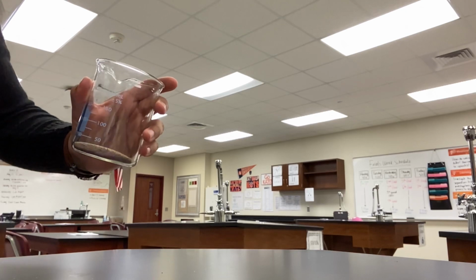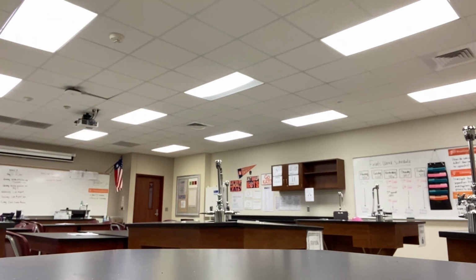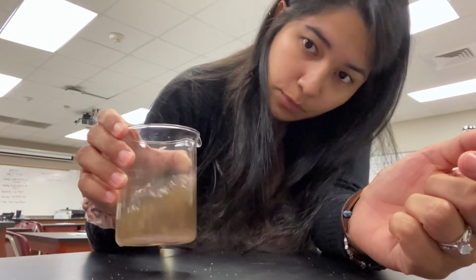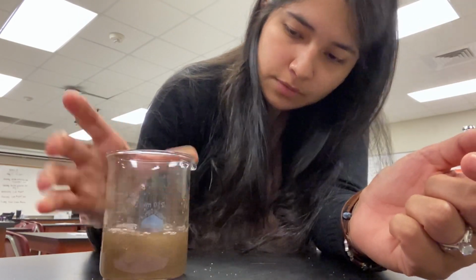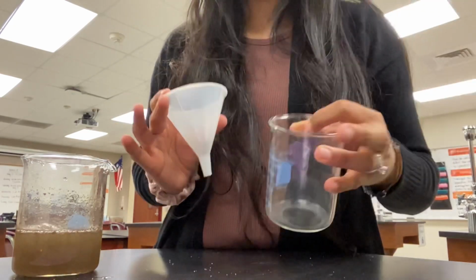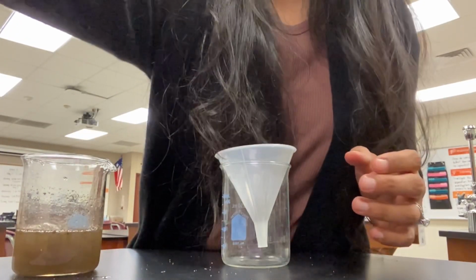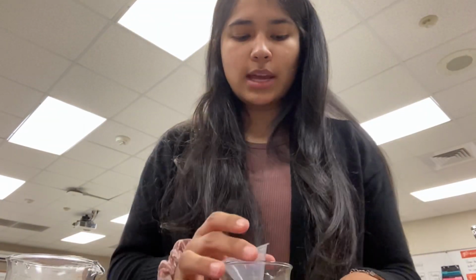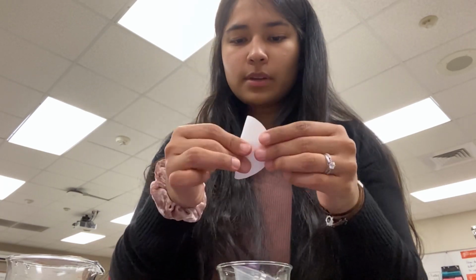So I'm going to grab some water. And then I'm going to start filtrating. I'm going to allow my ionic compound to dissolve. In the meantime, while it settles a little bit, I'm going to get my funnel, my beaker, and also my filter paper. Actually, because I know that what we have in here is going to be sand, I'm going to get the small funnel because I want to use a better filter.